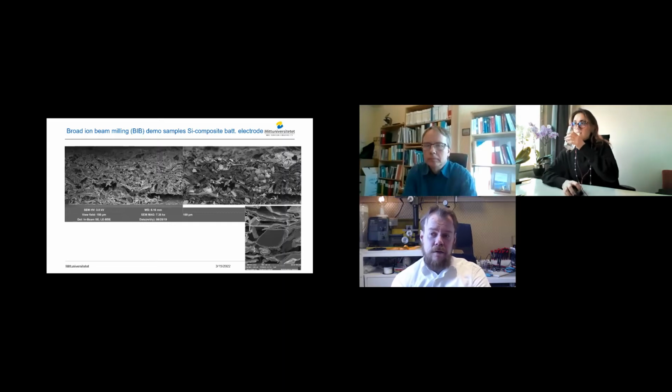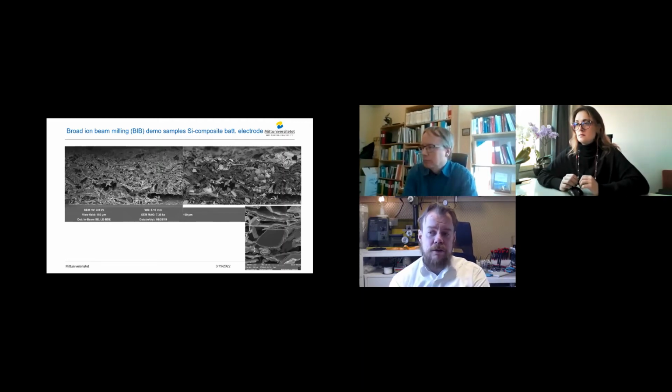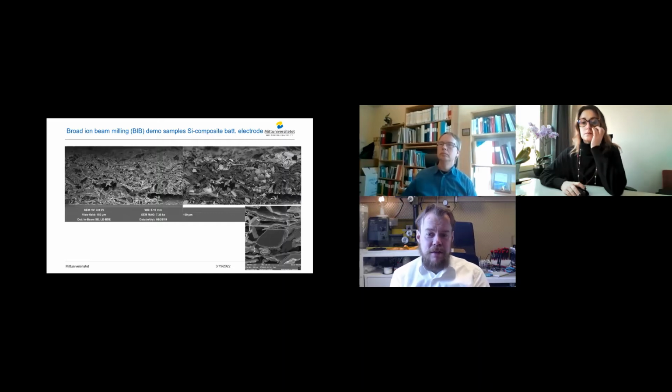It depends on how large the pores are, and how rough the surface is when you have it against the titanium mask. This is a typical example that you can achieve very good results even if you have high porosity in the material. This material contains graphite, which is semi-hard in this technique. It is harder than paper, of course, but less hard than silicon particles.